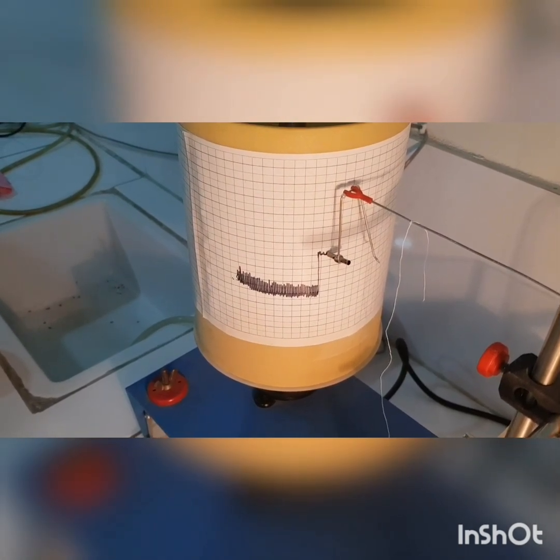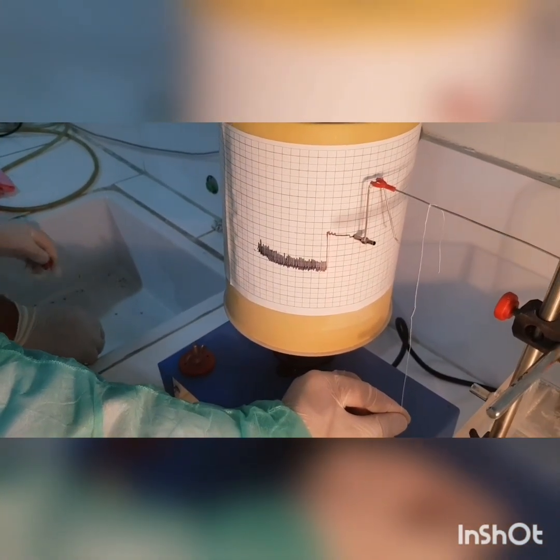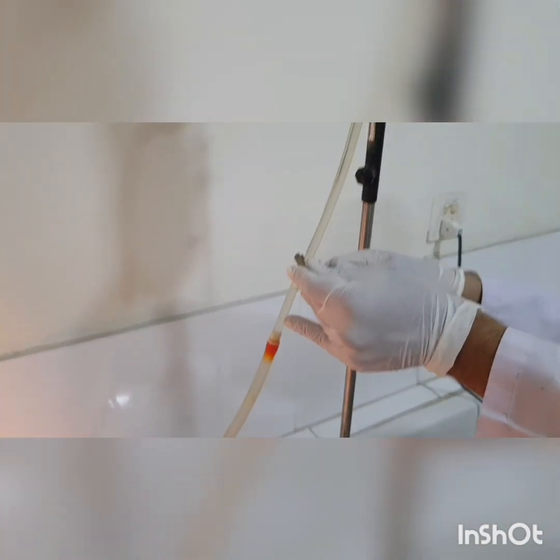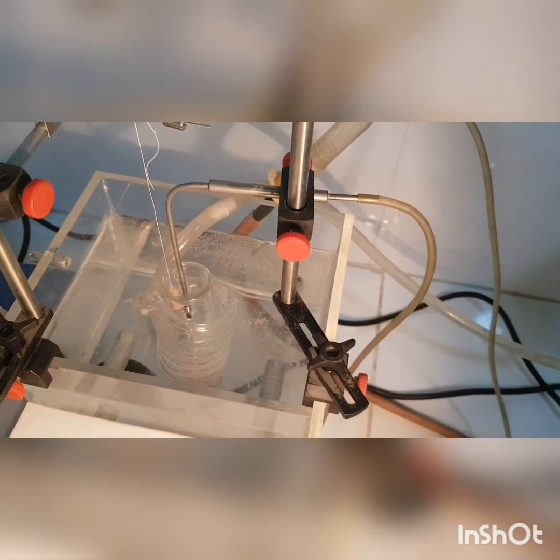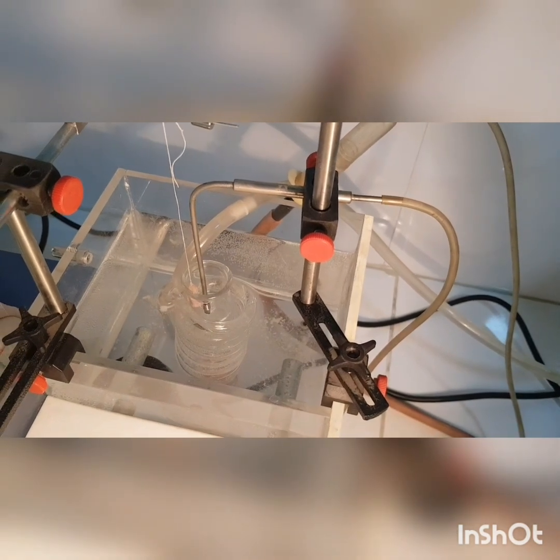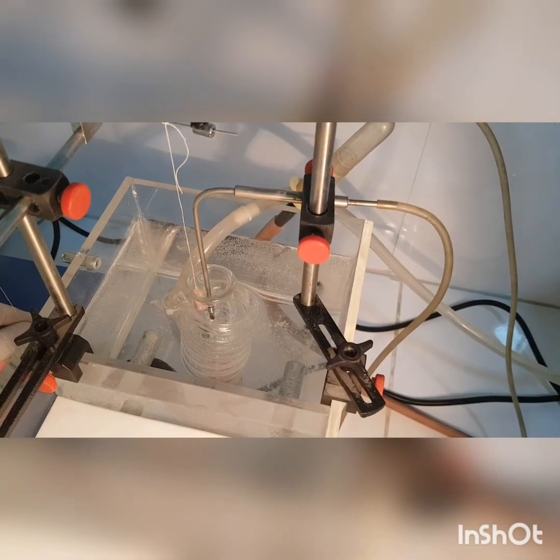After the effect of the agonist, now we wash out the drug, meaning the solution along with the drug, and we supply fresh nutrients from the nutrient reservoir bottle. We will repeat this procedure 2 to 3 times.